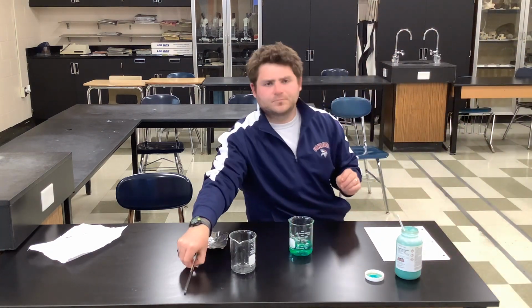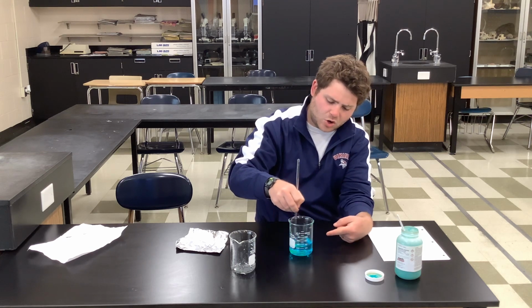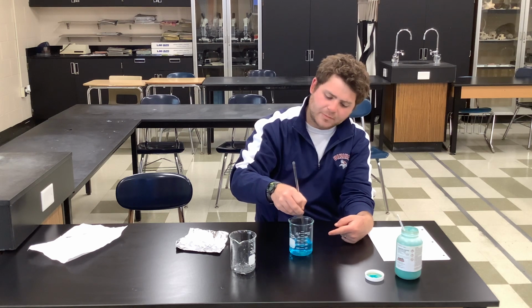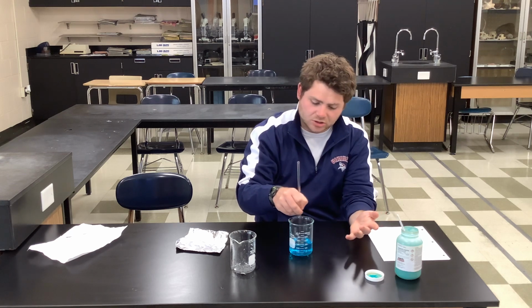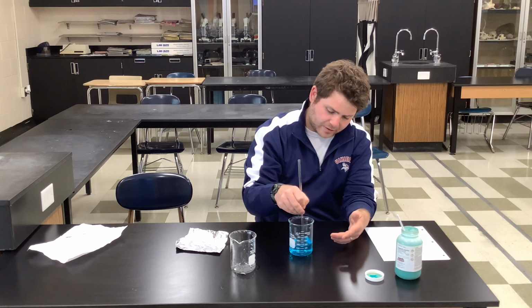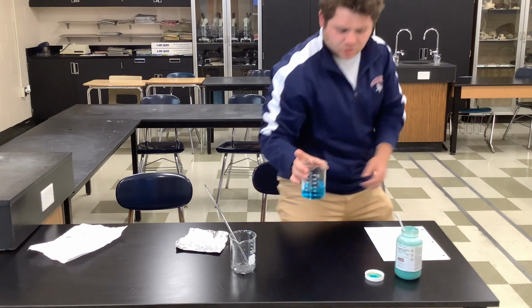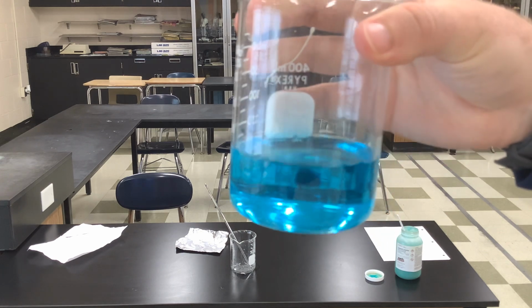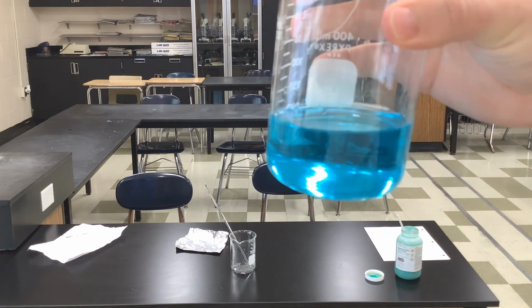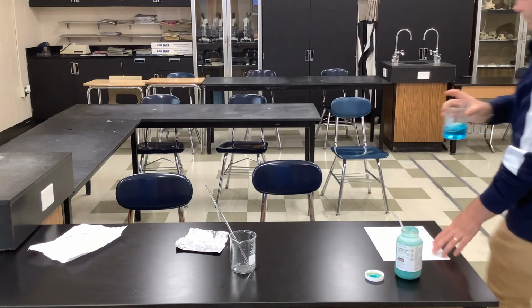Next, you're going to take the glass stirring rod, and you're going to mix it up. You're going to stir it up, and notice how a color change happens. So we said earlier, color changes typically are chemical changes. So a chemical change just occurred. And if we look at our solution, okay, there is no more copper chloride. All right, so the color changed. Now we have a nice blue looking color, and there's no more copper chloride there on the bottom. Okay, so we had a chemical change happen.